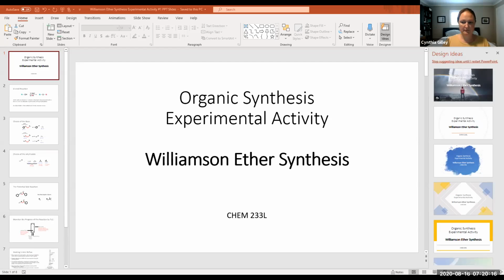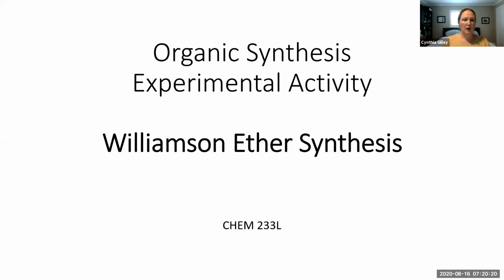Hi everyone, this is a pre-lab lecture video on the Williamson ether synthesis. Okay, so we're doing an organic synthesis, which is a common type of experimental reaction for second semester organic chemistry.